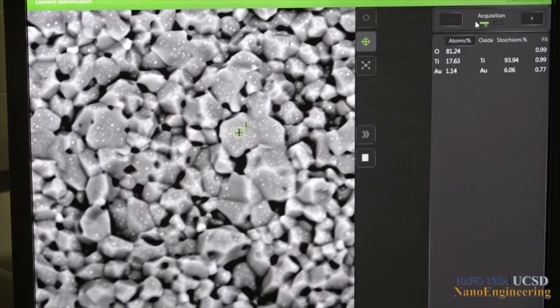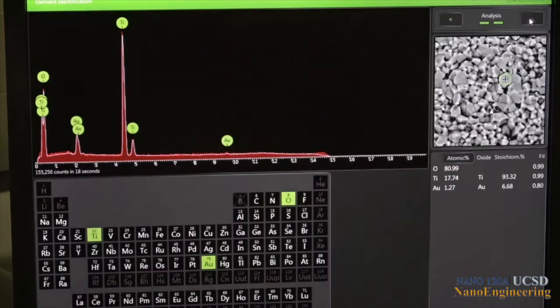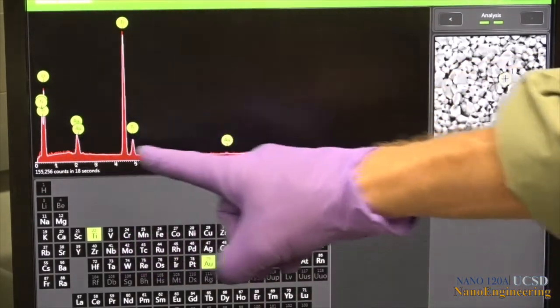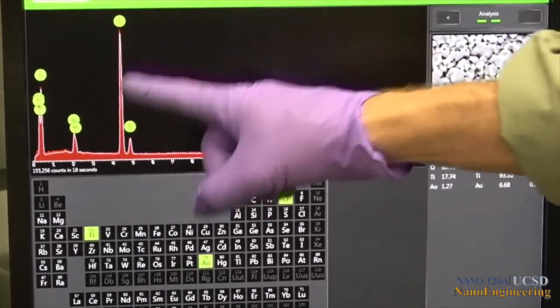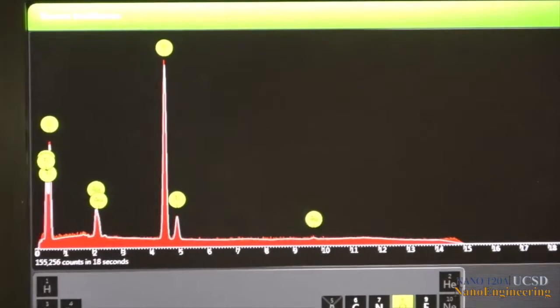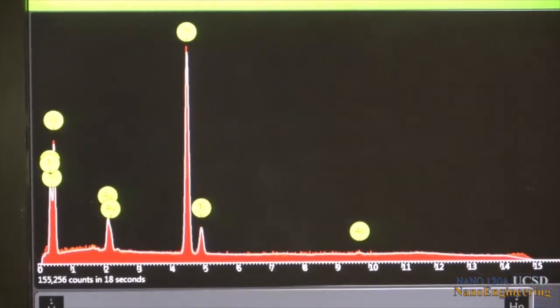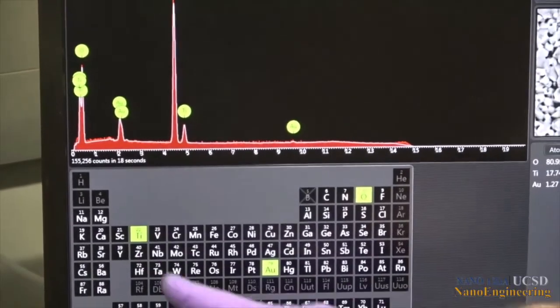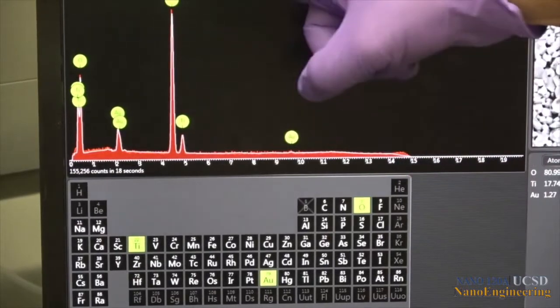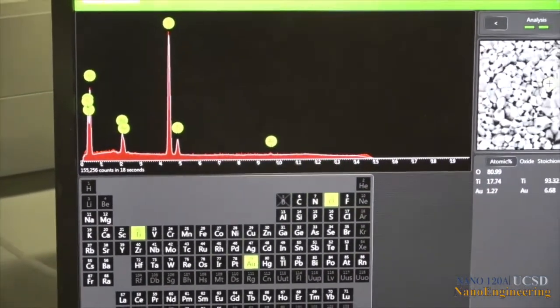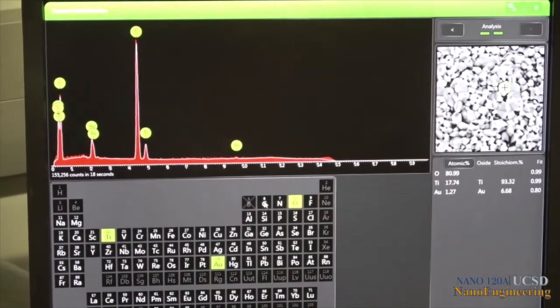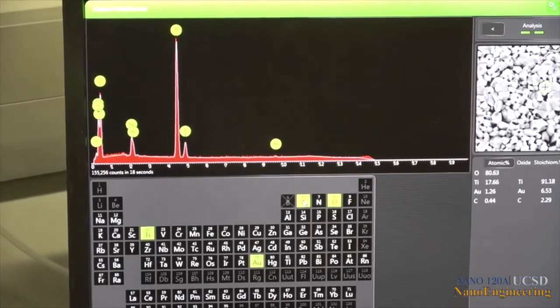We can move from acquisition to analysis by clicking on the upper right arrow shown at the top right of the screen. This then displays the X-ray peaks as a function of the energy. In addition, the elemental periodic table below the spectrum assists in navigating analysis and the display of the spectrum. Elemental boxes appearing fully green means that the element is labeled as shown by the green circles in the spectrum. Left clicking on the element in the periodic table turns the element box green and labels the spectrum with that element in the region of energies where it is expected to appear.